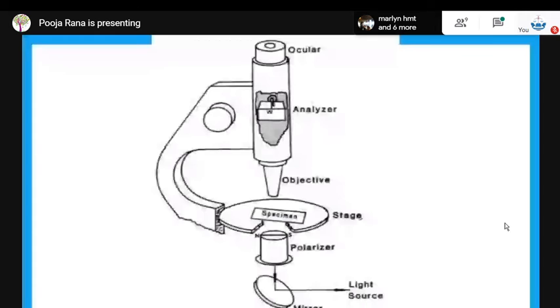All right. Metal is, I actually don't know the name. Shall I call you Lizzie? So Lizzie, metal is not a biological evidence, so we are not taking it into account right here. Oh, okay. So otherwise, metal can also be examined under the polarized microscope to check the structure of that particular metal.